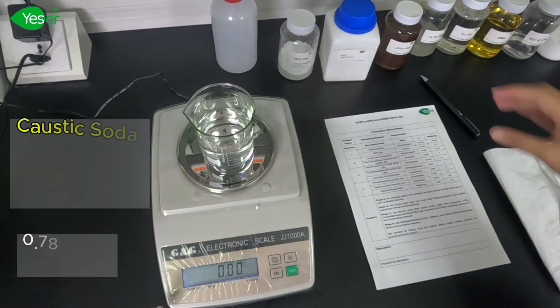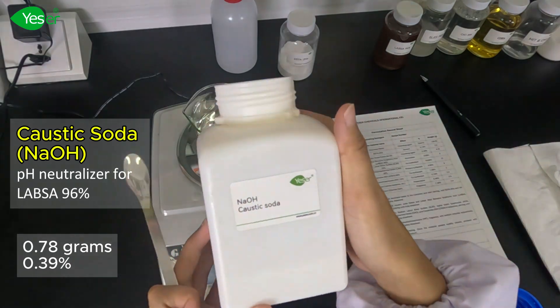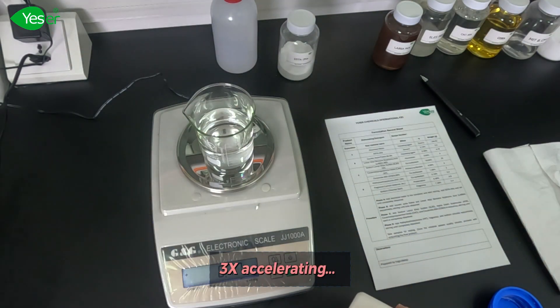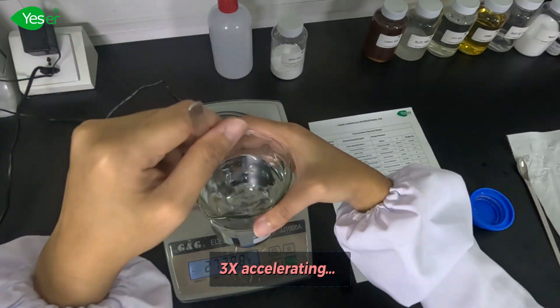Next will be our caustic soda, or sodium hydroxide. This will be our pH neutralizer for LABSA 96%. We will weigh about 0.78 grams of this, or 0.39% for the formula. Mix and stir until fully dissolved.